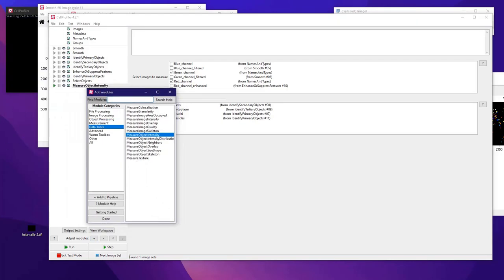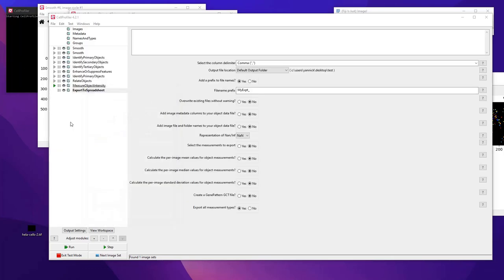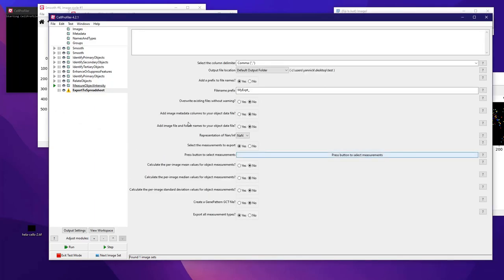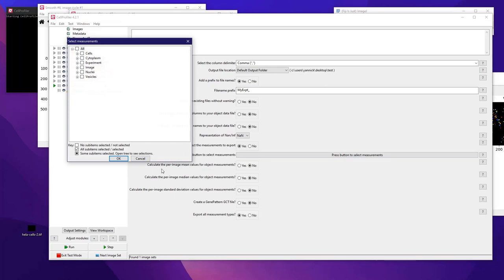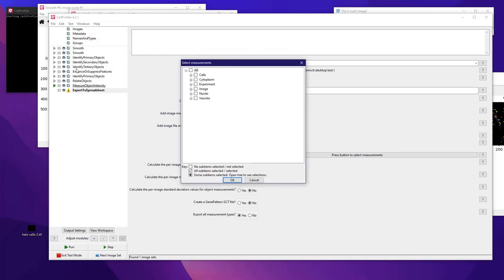We add a step in 'Data Tools': 'Export to Spreadsheet'. One useful option is 'Select the Measurements to Export' — you press the button and can specify exactly what you want. I just want information on the vesicles and on the cytoplasm.